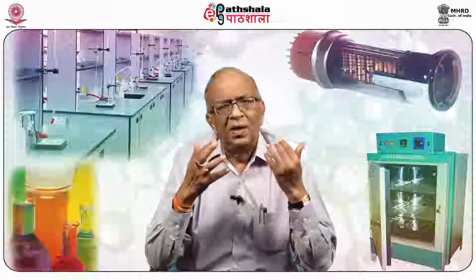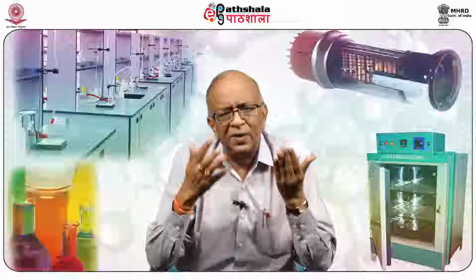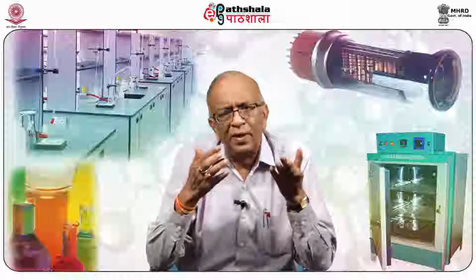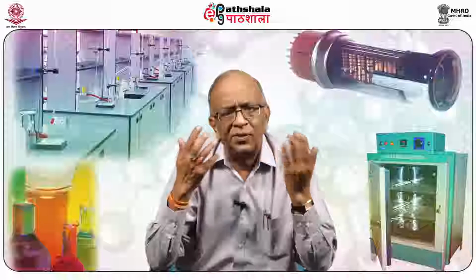So this is temperature dependent. With temperature, things are changing, state is changing. Similarly, physical and chemical changes take place over a wide temperature range.